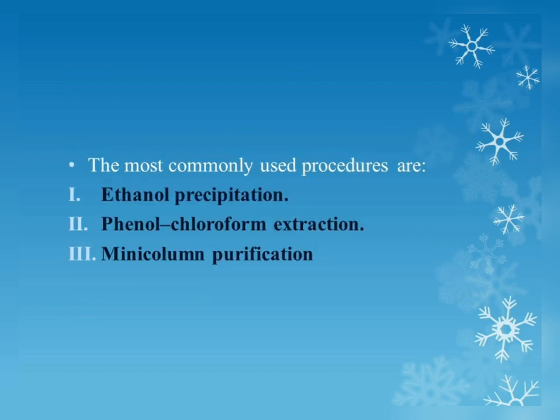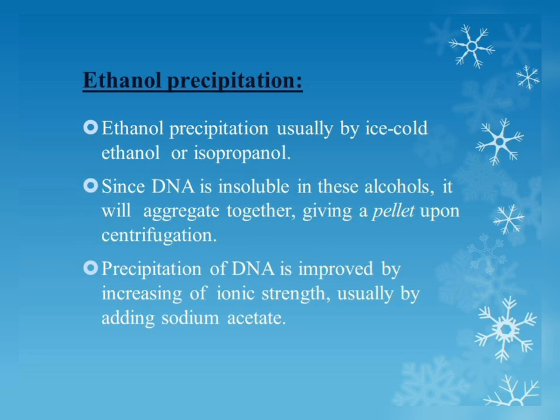Next, the most commonly used procedures are ethanol precipitation, phenol chloroform extraction, and mini column purification. Now let's come to the first step, ethanol precipitation.